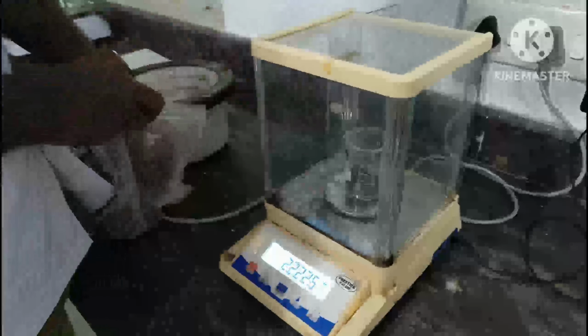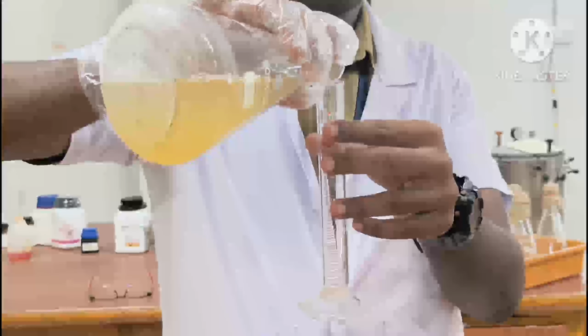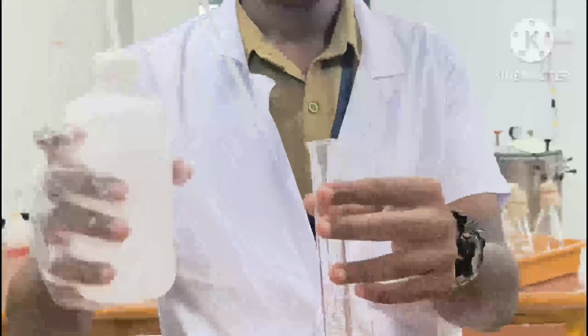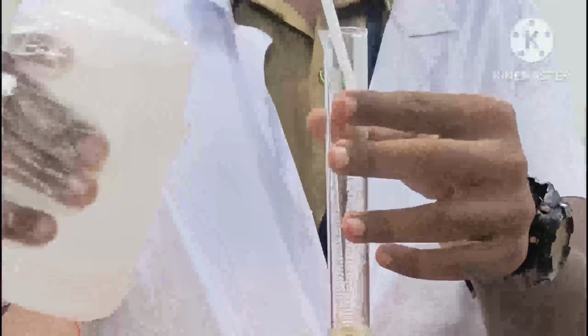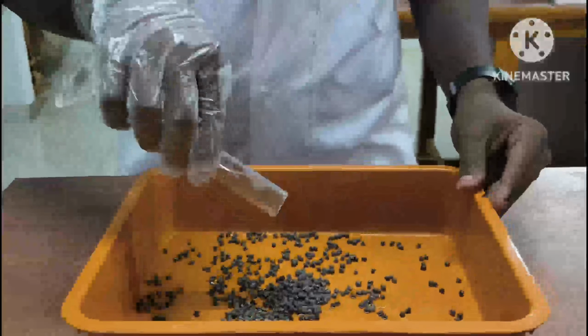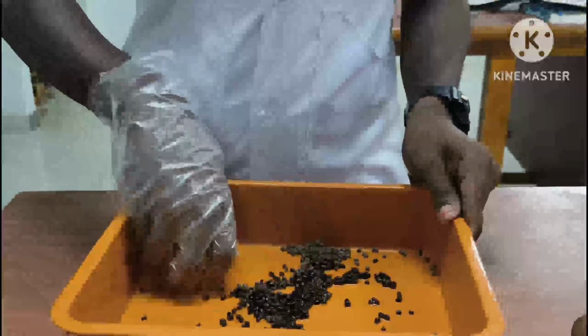8 grams of black gram variety Vamban 8 seeds were weighed and taken. 1 ml of respective bacterial broth was taken, and to it 9 ml of sterile distilled water was added. Seed treatment was done by treating the black gram seeds with this solution.